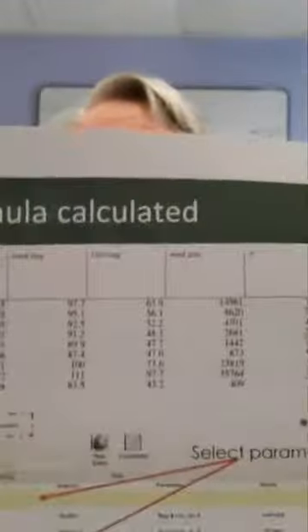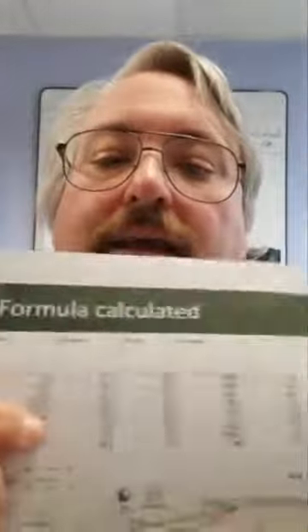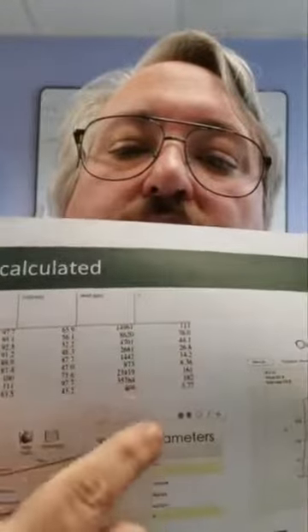One of the other reasons you might want to do that is in FlowJo, in addition to adding keywords and adding the data, you can actually add formulas. And again, if you click over here in this window where you're adding a new column, you click over to the third one, which says formulas. You can now enter a formula using the FlowJo tool that will call back to the files, and you now have a new column that's going to be a calculated field. And in this case, I was telling you we did a staining index, and here's the results of that. Here we have our concentration, which is one of the keywords that we put at the beginning. We've now also calculated the staining index, which is shown here.